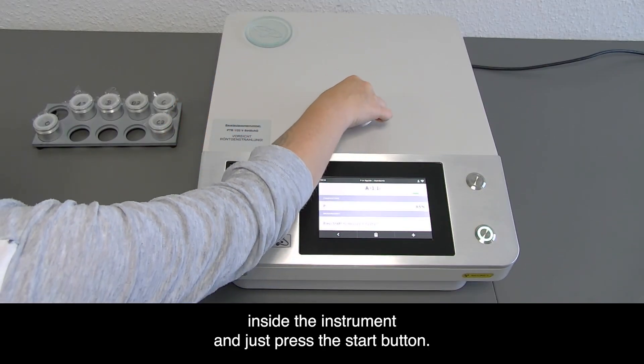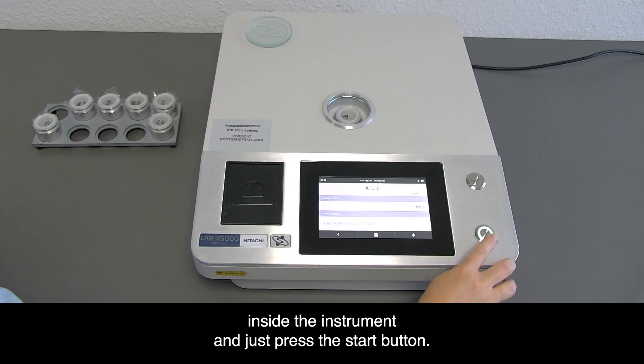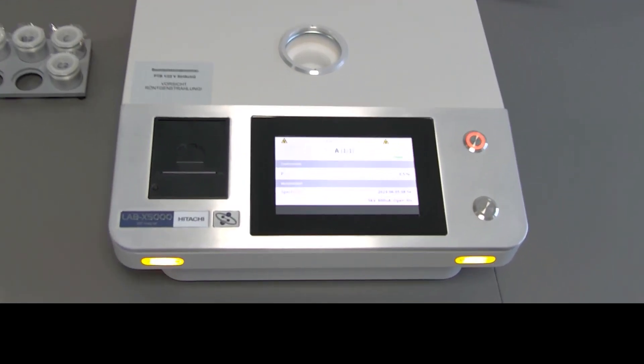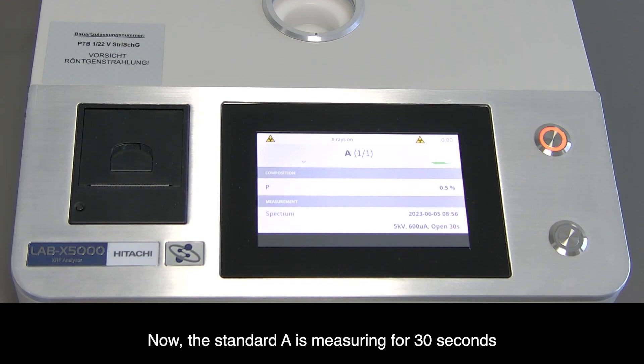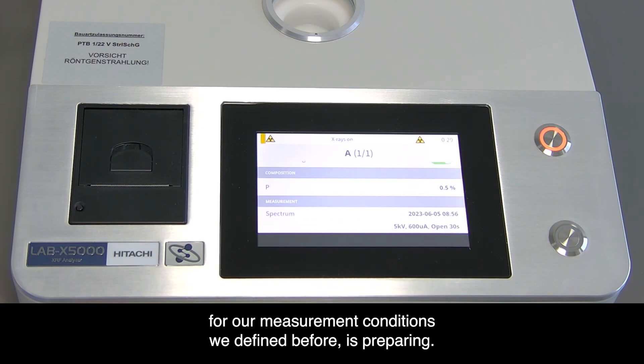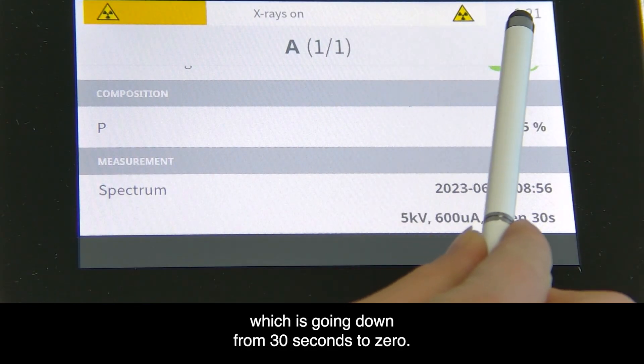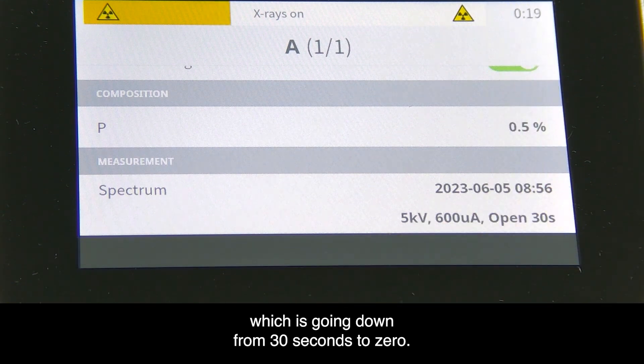Place it inside the instrument and press the start button. Standard A is now measuring for 30 seconds. We see the spectrum for our measurement conditions preparing. The time bar is going down from 30 seconds to zero.